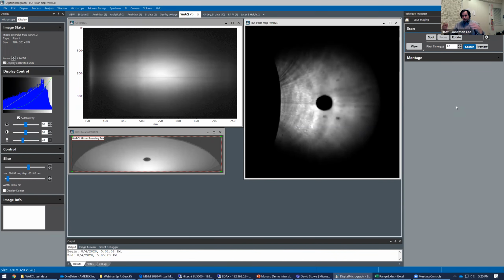If you can lower your beam condition, but be satisfied that you're going to be very surface sensitive, the more okay with that you are, the smaller you can make the generation volume by going to smaller and smaller voltage. In essence, your spatial resolution is effectively limited by the size of the generation volume and the beam. So if you can focus the beam very, very small, the generation volume is going to be slightly larger than that.